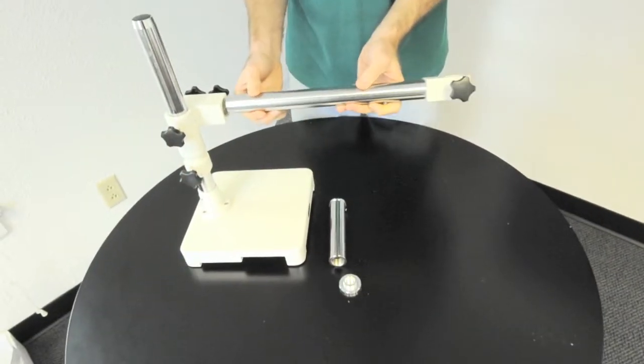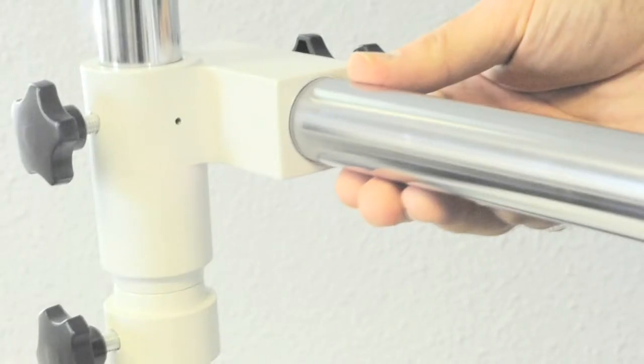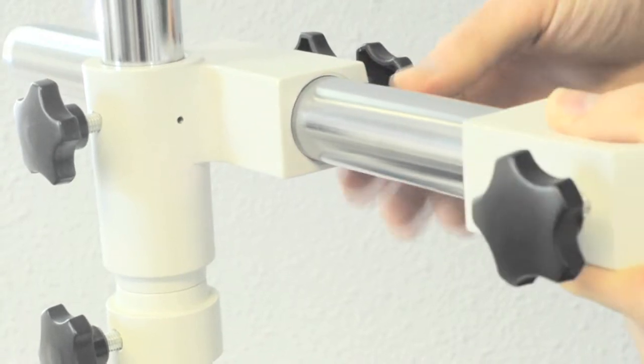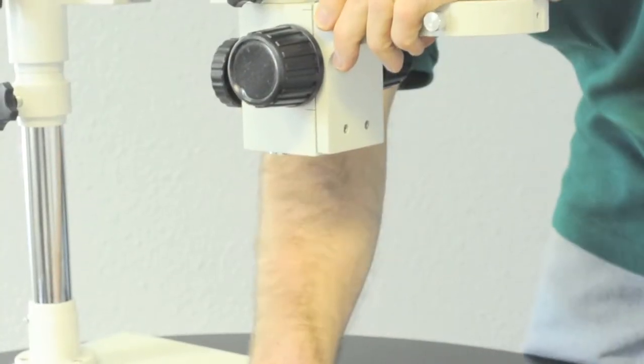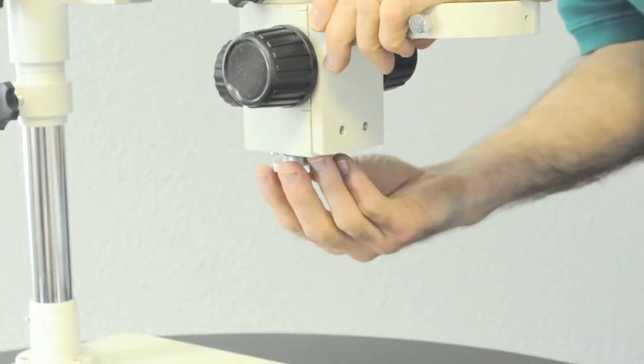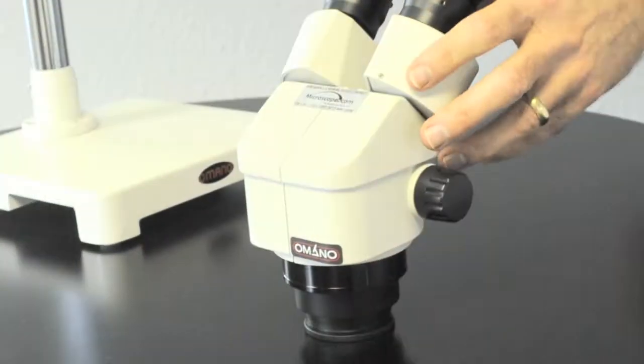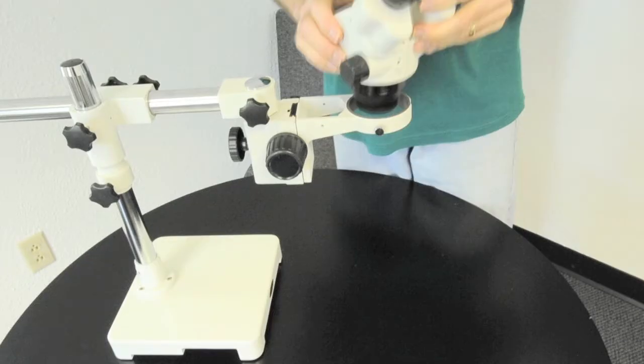Then the horizontal pole inserts into the attachment block. The hanging bar and focus block are then attached as shown. Place the microscope head into the focus block and tighten.